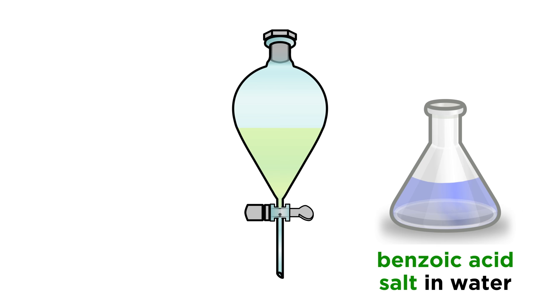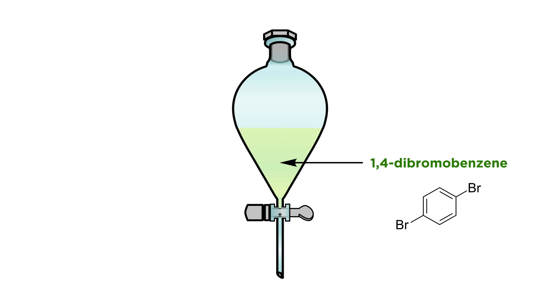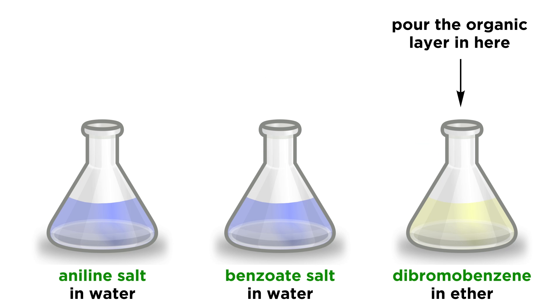So what's left in the separatory funnel? That will just be the dibromobenzene in ether, and we can pour that out the top, to avoid contamination, into yet another new labeled flask. Wash the empty funnel with a little ether to make sure we get it all, and add that to the flask. Now toss in a little bit of a drying agent, like sodium sulfate, to suck up any water that may have made it in there.